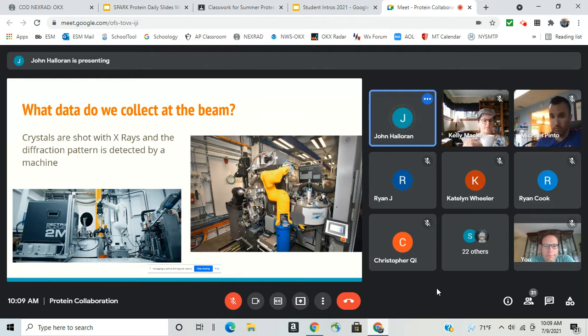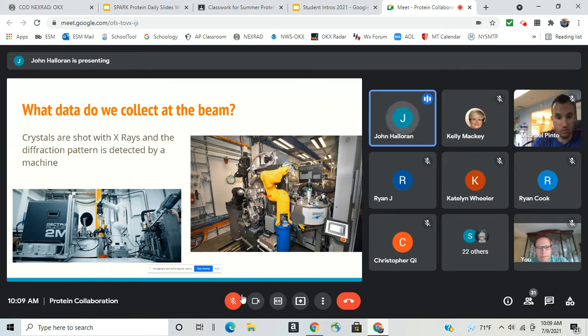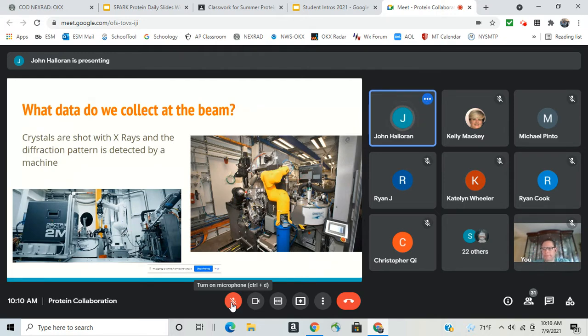Just to review and catch everyone up — what data do we actually collect at the beam? On the right here is the actual setup. The yellow 'Big Bird' robot is at AMX or FMX. Over here is where we mount the crystal, this is the cryo where the crystals are held, and back here is the actual detector.